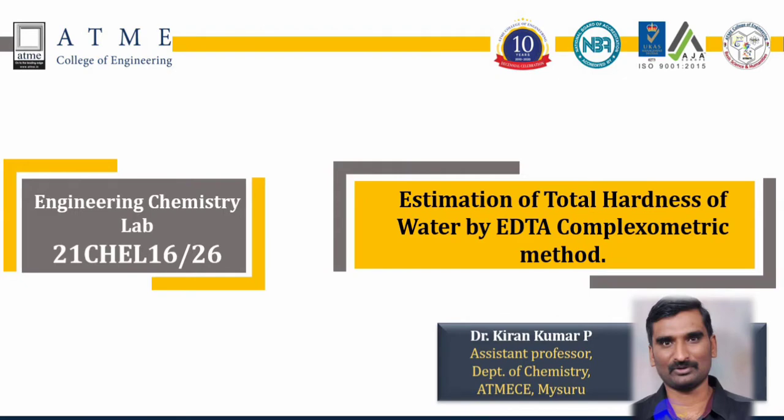Today's experiment is the estimation of total hardness of water by EDTA complexometric method. Hardness is generally defined as the ability of water to give lather. More lather means water is more soft. Less lather indicates the water has more hardness in it.